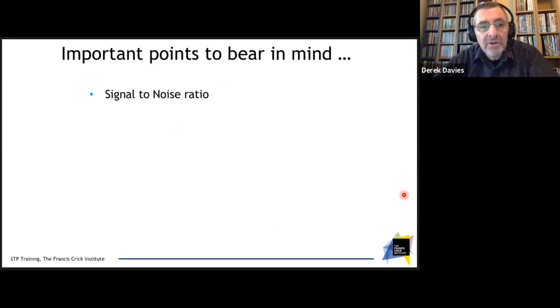So it's a combination of our fluorochrome, the brightness of our fluorochrome, and the amount of target that we have on our cell. Now, flow cytometry is a measuring system, so it's always going to have some noise, some background. And we're always trying to raise our signal and decrease our noise. So if I'm doing a 1 colour experiment, that noise comes a little bit from background noise of the cytometer, but mostly from autofluorescence of my unstained cells. So that's really all I have to consider.